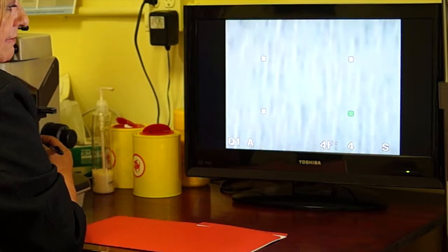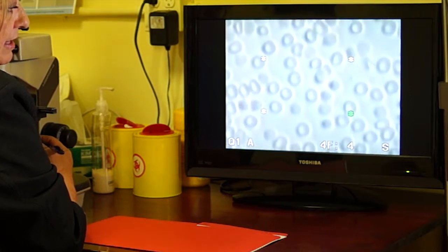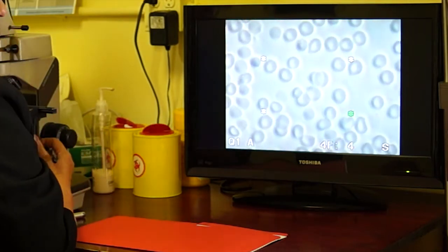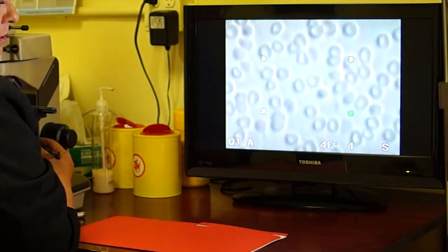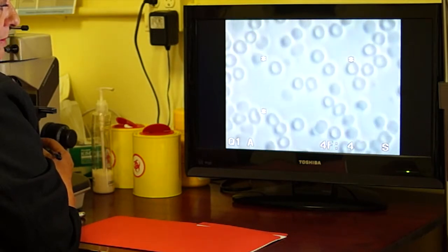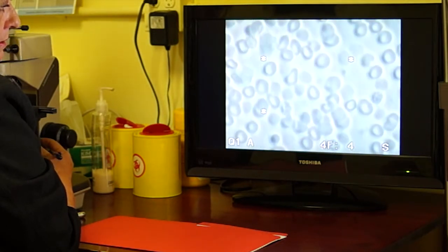We can see lots of different things in the live cell. Everything from bacteria to cells that don't have any oxygen, like these ones. It's an indication that you need to do more deep breathing, perhaps some aerobic type exercise.